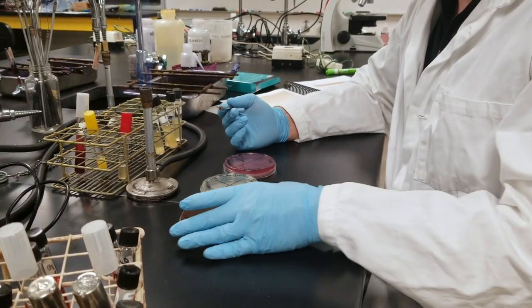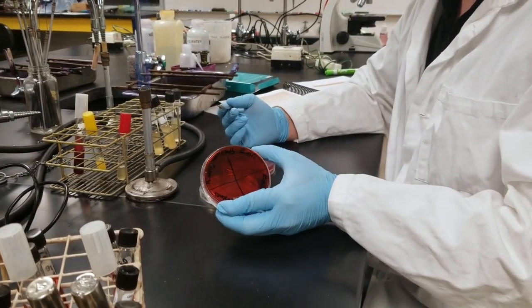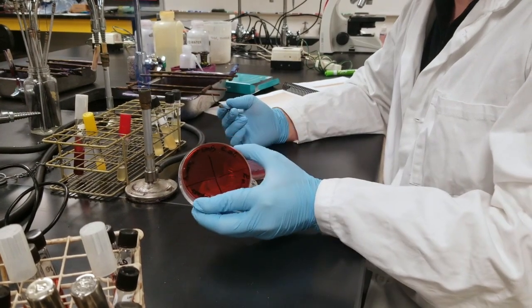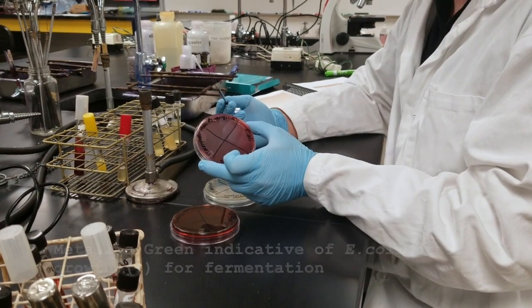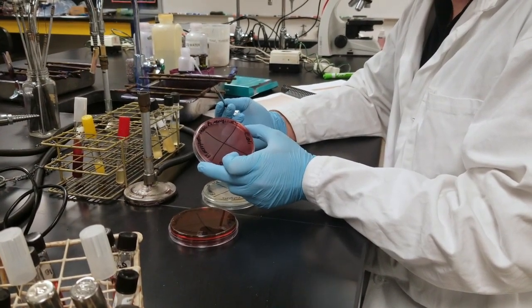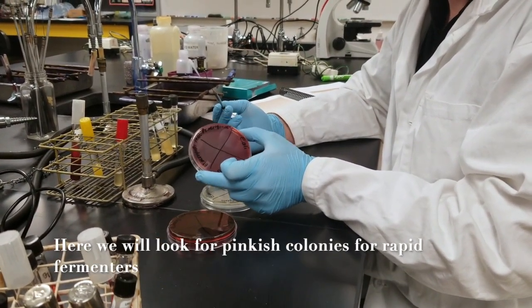We have our EMB plates which will have a metallic green color positive for fermentation, and then MAC is also another plate that will be differential for fermentation as well.